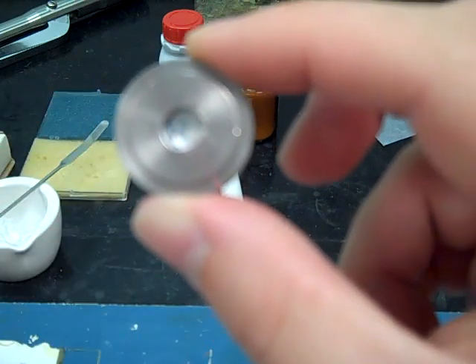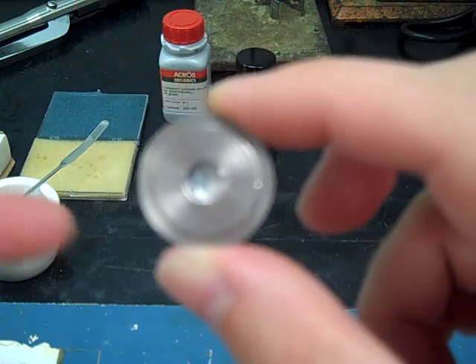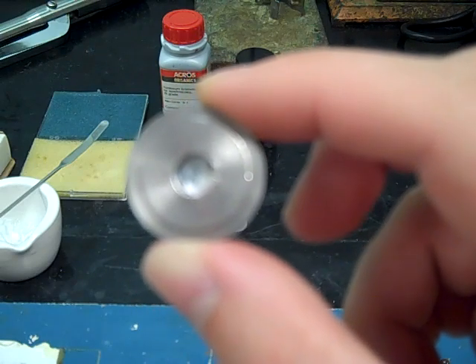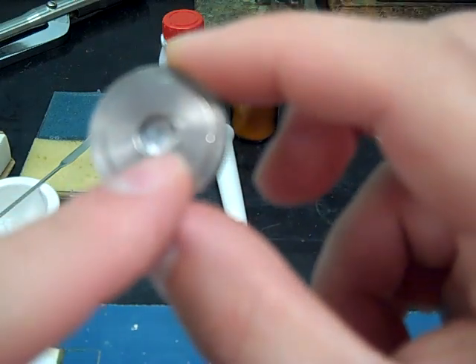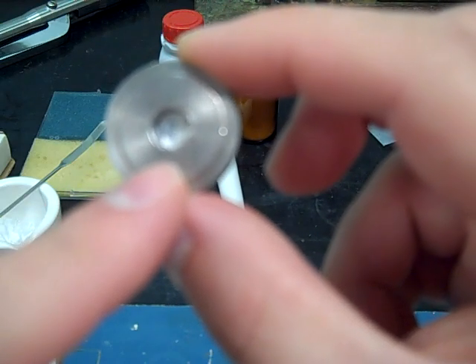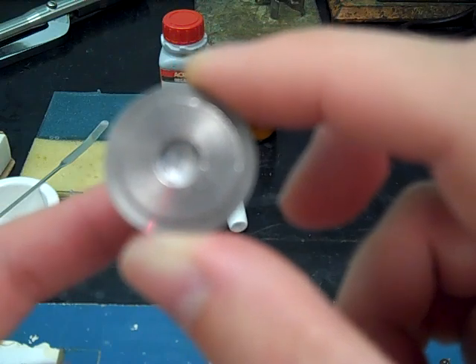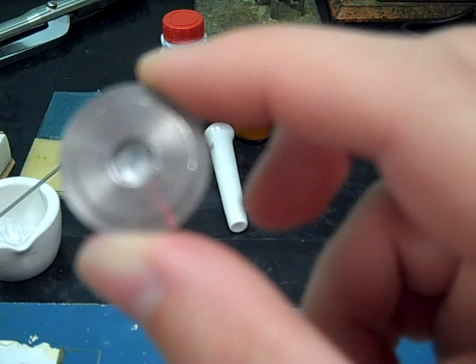That transparent or translucent nature is going to be important because IR is going to actually have to travel through that pellet in order to get some kind of absorbance when we put it inside the machine. So if yours is too thick, and you can kind of see some thicker parts down around the bottom on this right side, then it's just not going to be able to obtain a good looking IR. If you have to, you may need to remake the pellet so that you've got some translucent nature and you can see some of that light difference when you put your hand behind it.